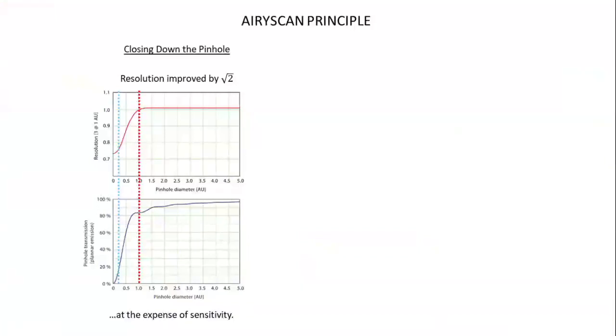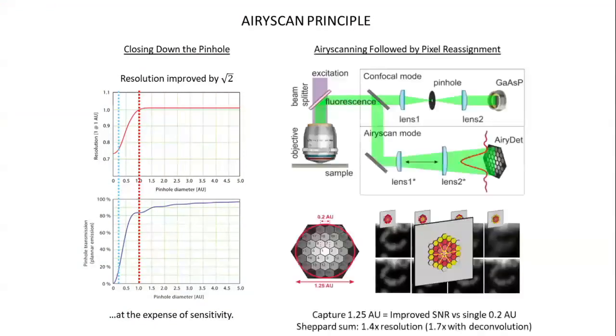All right. So we just talked about this business of shutting the pinhole and resolution and why closing it down. So there is a neat solution to that problem, and that is this so-called Airyscan detector. So this is one of a number of variations of a theme, but it sort of explains the idea. So in the microscope, we could either go through the standard pinhole up here, that one, or we could sort of basically magnify the spot and spread it out over a multi-array detector.